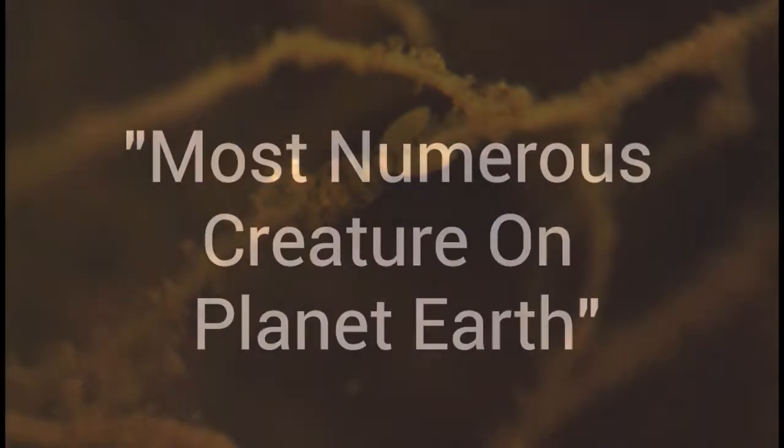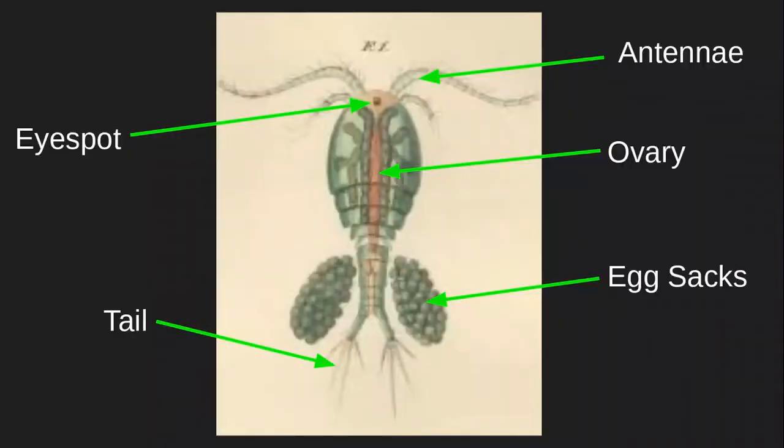Copepods. They might not be the first thing you think of when you hear most numerous creature on planet Earth, but here we are. These microanimal crustaceans live in any body of water with enough nutrients to sustain it, and can eat pretty much anything that comes along, from algae to bacteria to other zooplankton. The anatomy of a copepod is fairly simple. They swim by flicking their front antennae and locate prey using their one red eye.